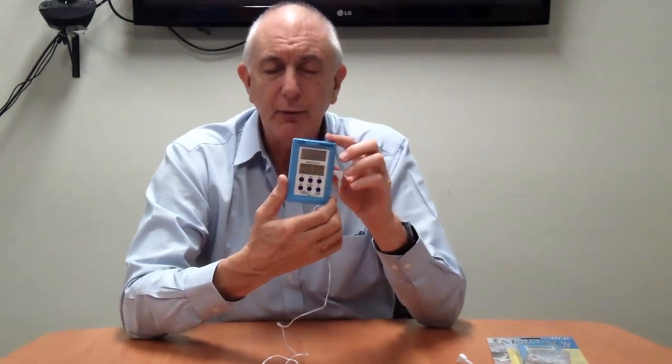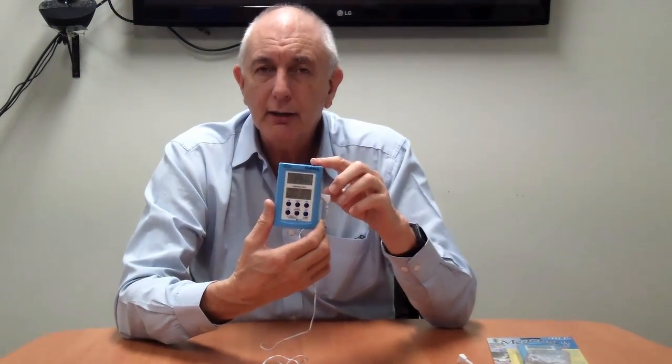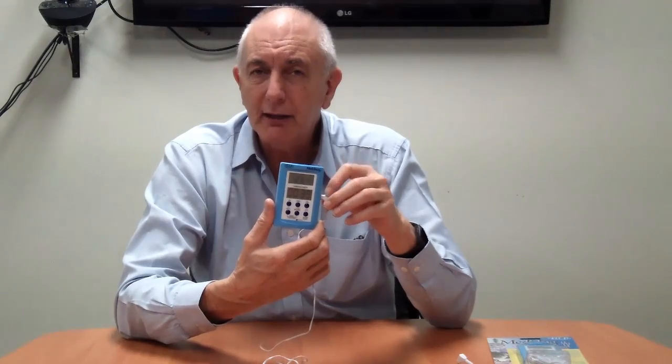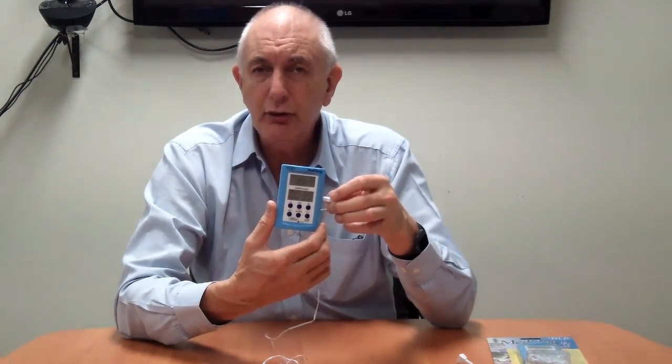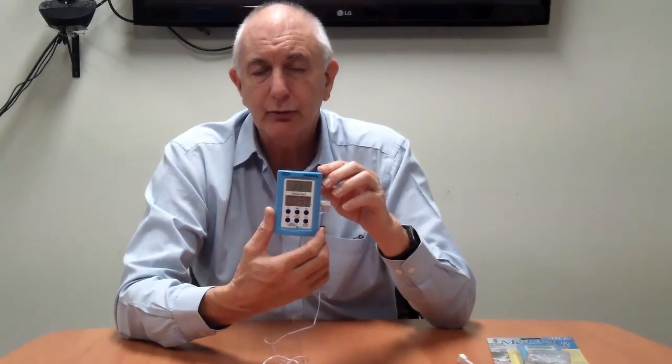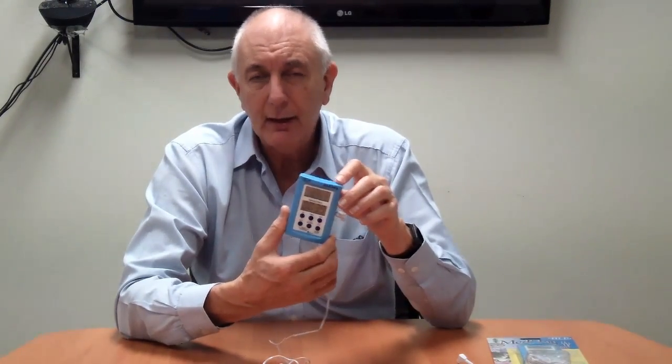The beauty of the Medi-Log is that because it's been designed for vaccine use, it actually comes preset with the alarm settings for the recommended vaccine storage by the World Health Organization and most of the Australian health authorities, that being between 2 and 8 degrees C.